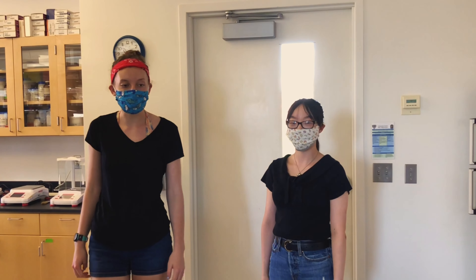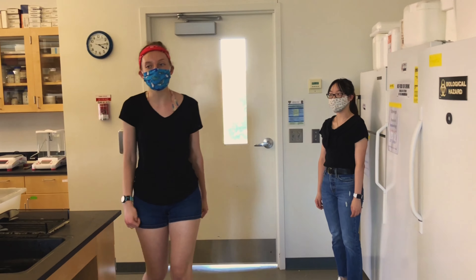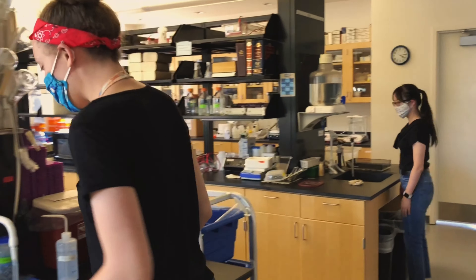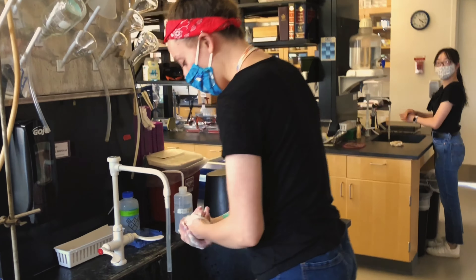Remember when you come into the lab to stay 6 feet apart from each other. Make sure that you follow social distancing rules. The first thing that you do when you come into the lab is wash your hands. Make sure you do this using warm water and soap. Hand washing should take you no less than 20 seconds. Make sure you do a really good job and get every area on your hands.